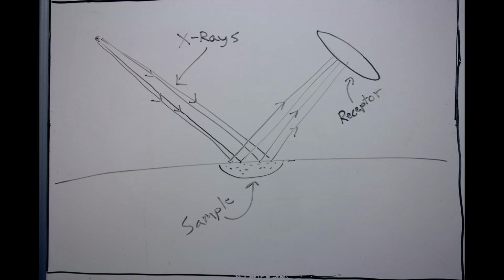X-ray diffraction is also used to determine the shapes of larger molecules, including vitamins, drugs, proteins, and nucleic acids such as DNA.